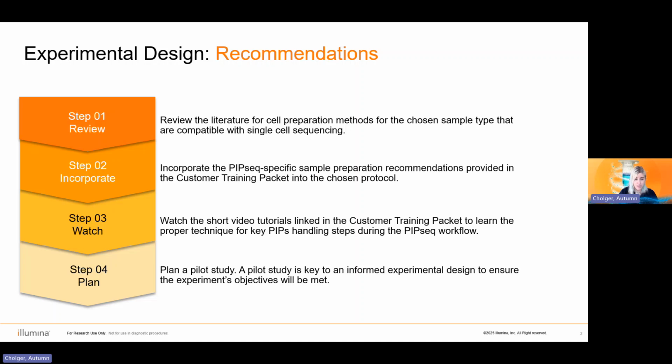And last but not least, we want to make sure that we're planning. A pilot study is so crucial to that larger experiment design. We want to make sure that we're meeting our experimental objectives when we scale up to do that bigger experiment. So planning a small pilot study and optimizing these upstream sample prep workflows is very beneficial in the long run.